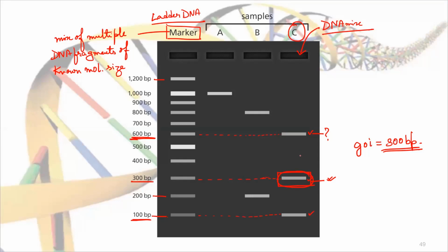So the principle is, irrespective of the nucleotide sequence, the separation is happening based upon the fragment size. So we have taken some other DNA molecule whose fragment size is already known to compare with the DNA molecule of our interest, whose fragment size is known but we cannot identify where it is located.